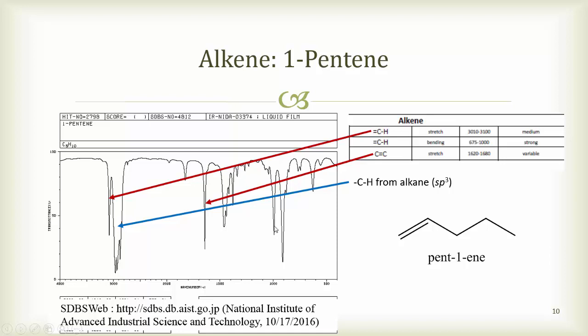As with this one, there tends to be another peak in this region from time to time. There are two, one again from 910 to 990 and another one from 885 to 895, and they are sometimes more intense or less intense. You sometimes can also use this region to look at cis disubstituted versus trans disubstituted alkenes. If you have a cis disubstituted alkene, you would be seeing a peak of different intensities around 665 to 730.